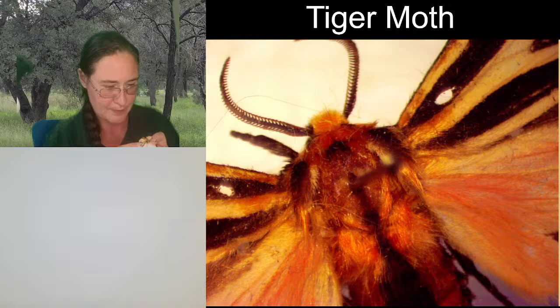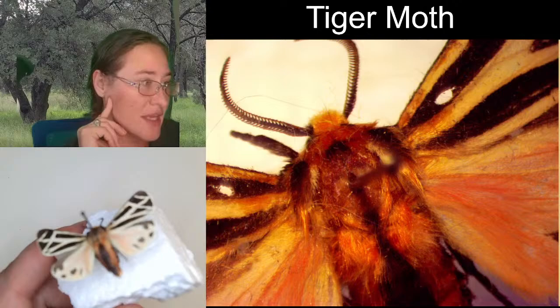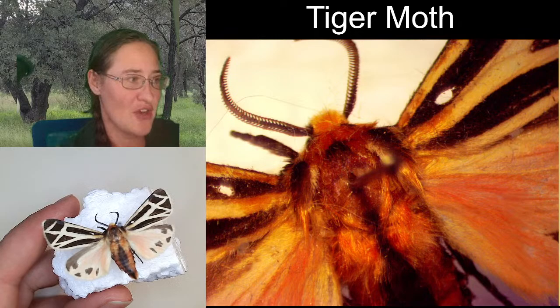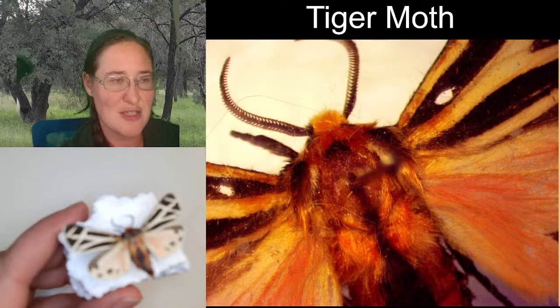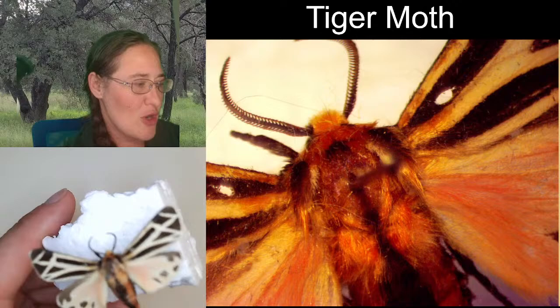This specimen was collected in 2010, so it's already 13 years old, which means that the pink in the hindwings has faded out a lot. Arctiids are known for having these really bright hindwings, but that color is fading pretty good. I also want you to take note while you're looking at it underneath my desk camera that the color is significantly different than what you're seeing under the microscope. Admittedly, the microscope kind of darkens and makes the colors a little bit more vibrant, and that's what it looked like back when it was vibrant. But it's not black and yellow like it may appear. It's more black and white on the front wings, and then pink with those black spots.